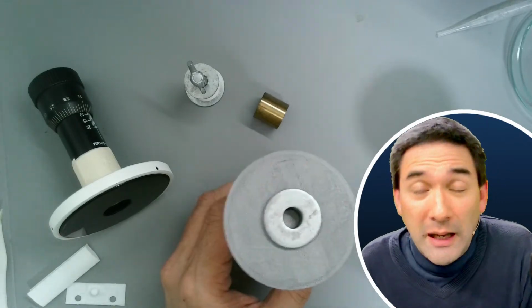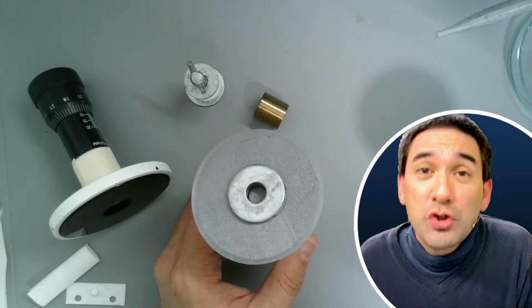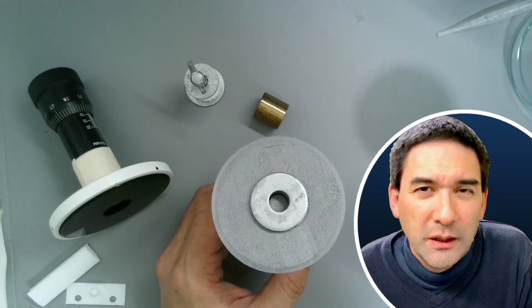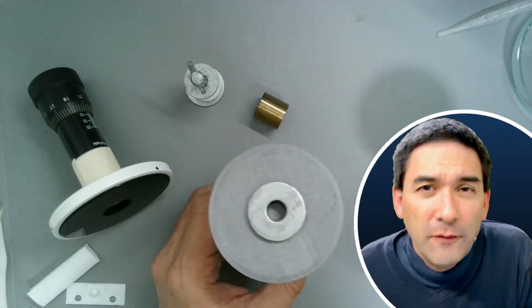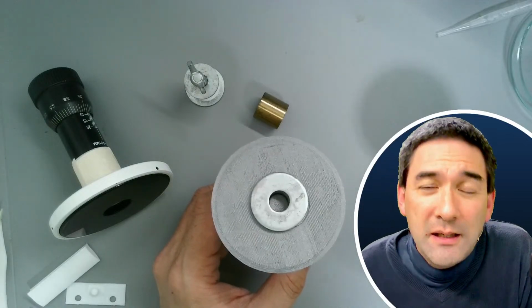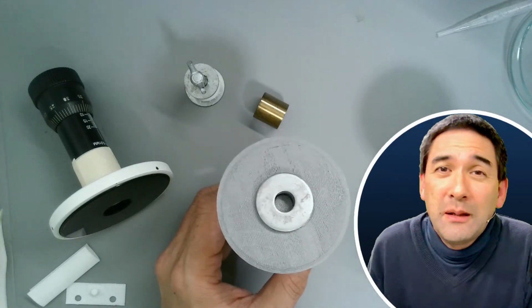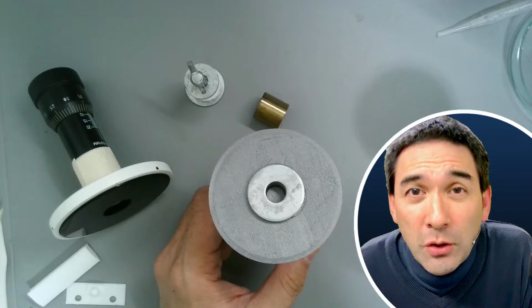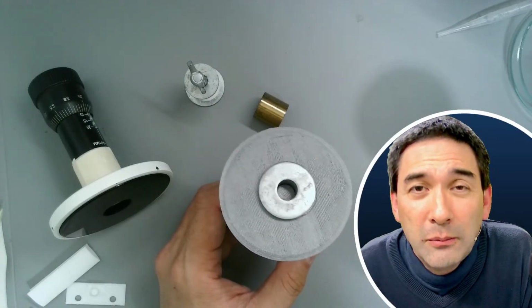And I have to tell you, I don't know why they did not include that, but there's a general criticism. I don't know if it's a criticism really, but let's put it positively. I have a general advice for microscope slide manufacturers, and that is please, why do you not include better documentation? Sometimes you can buy the slide, it says maybe a whole mount or a cross section, and then you put it under the microscope. But where's the learning effect if I don't actually know what I'm looking at?